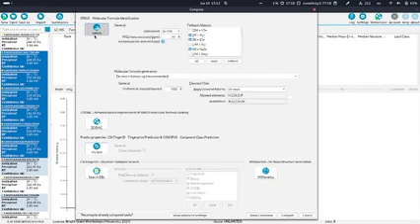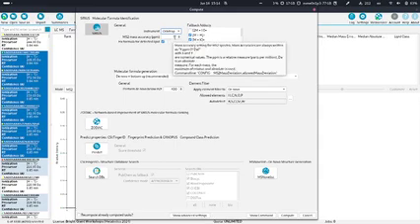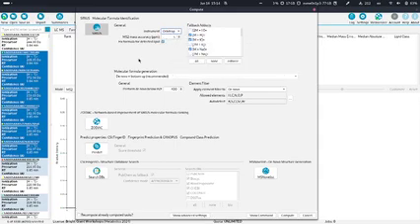Okay, for SIRIUS, so for the molecular formula identification, especially because Kai said already we have all these different names for the methods. Here in this compute dialog, there's at least a small description of what every method does. So SIRIUS is for the molecular formula identification. What you can select here, for example, is the instrument you use to measure the data. This is like a profile, meaning now for QTOF we have an MS2 accuracy of 10 ppm. And if we go, for example, to Orbitrap, it will change to 5. So this is just a profile which will be used.